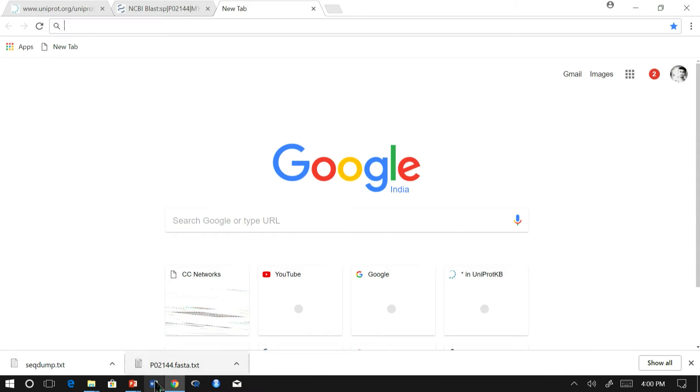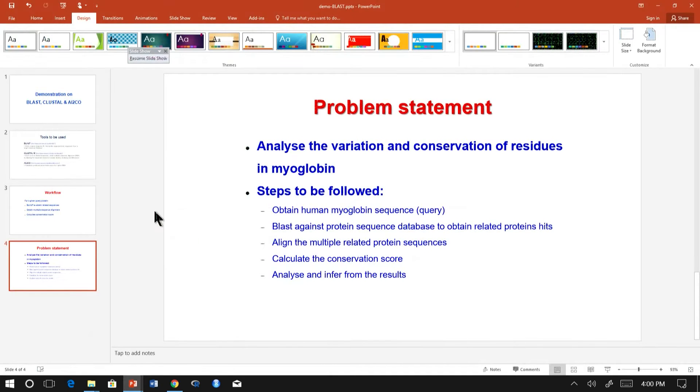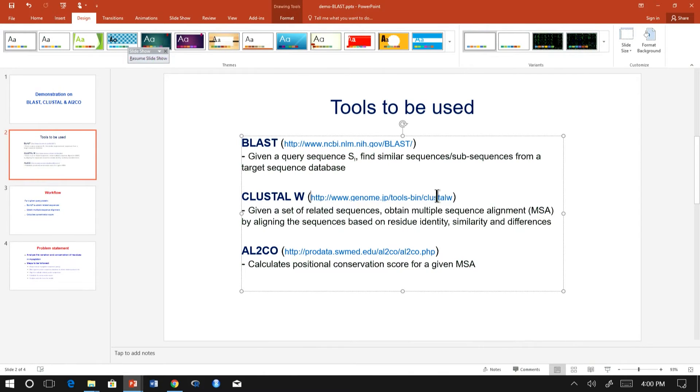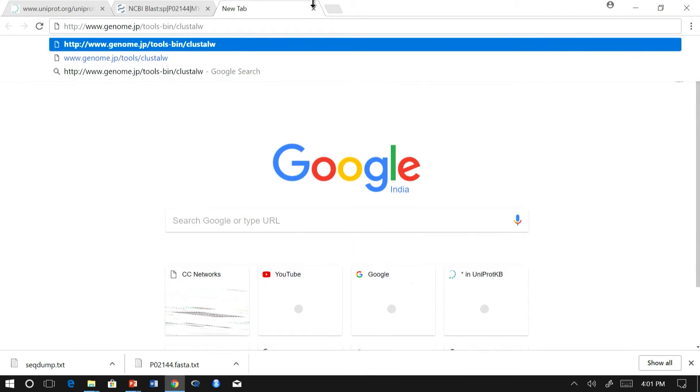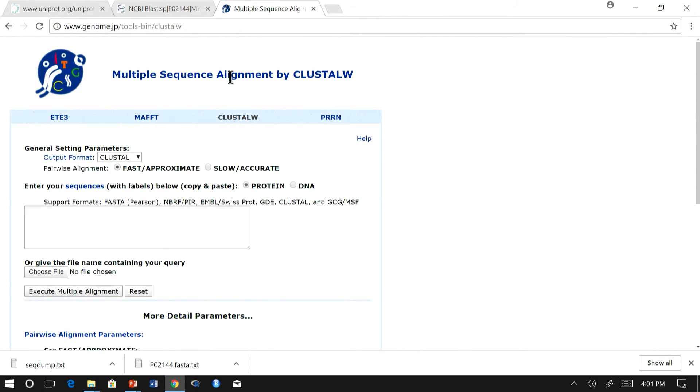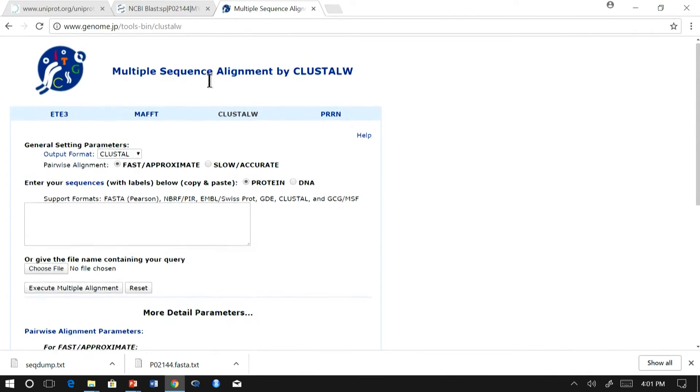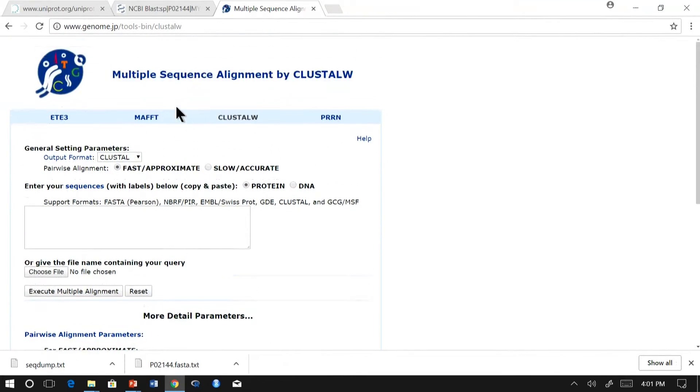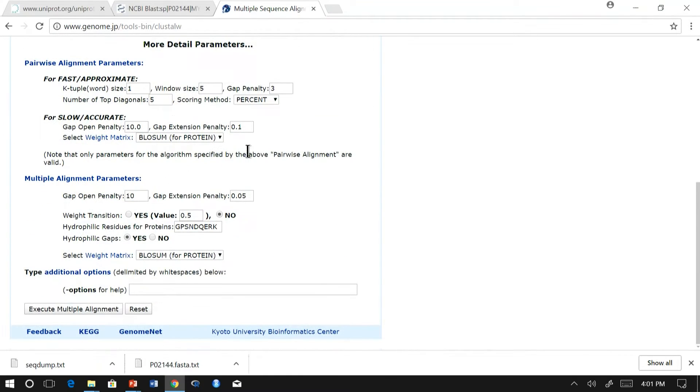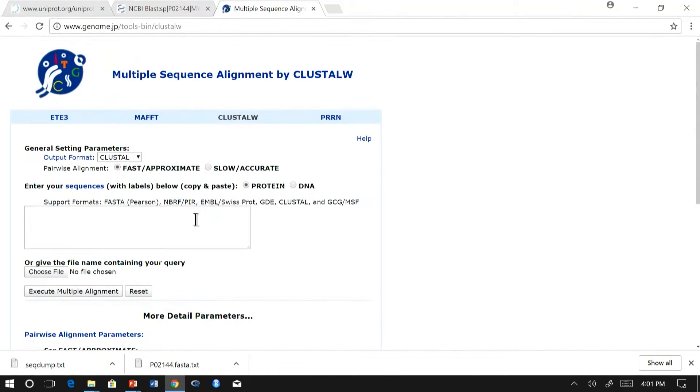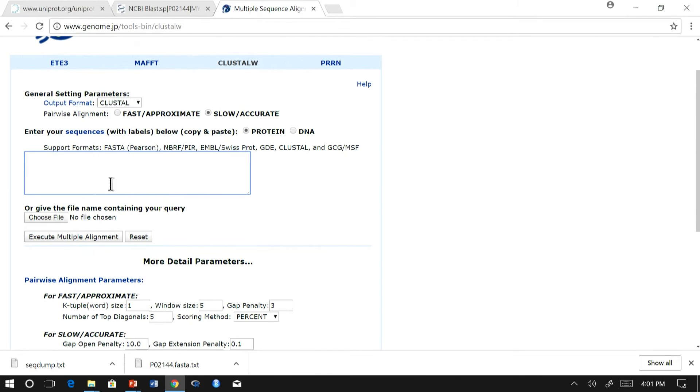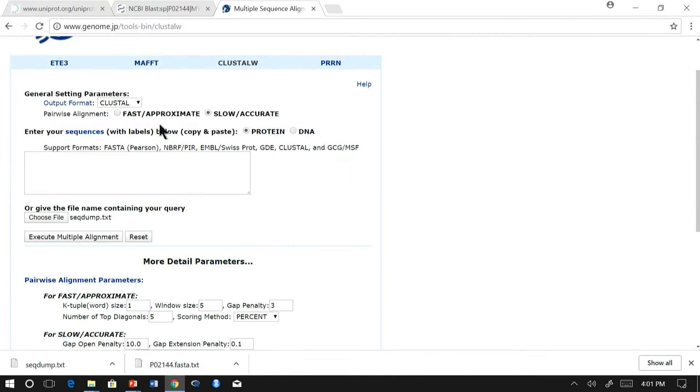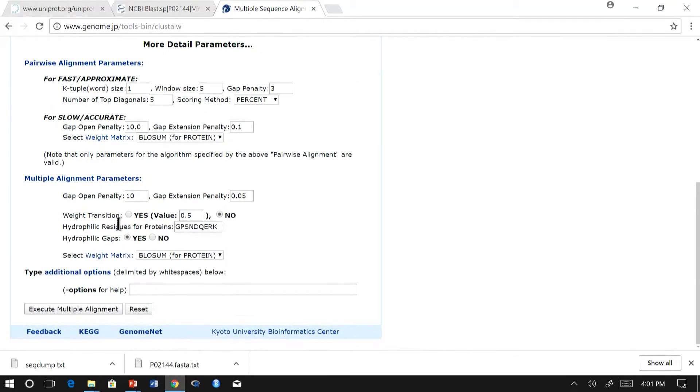We will use this for alignment with ClustalW. Let us go to ClustalW website, which is hosted in genome.jp. ClustalW was originally implemented in EBI site. This website also has parameters which are similar to what we found in BLAST for alignment. I am going to choose the accurate method and choose the file and submit the job.